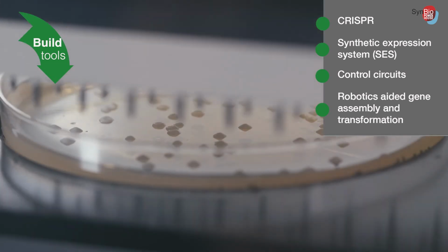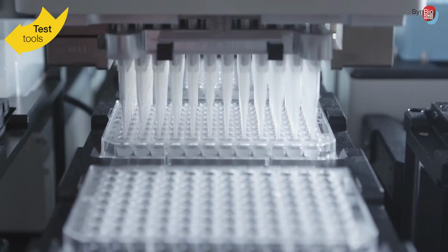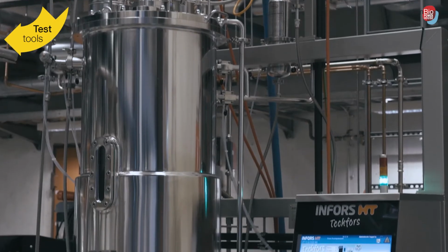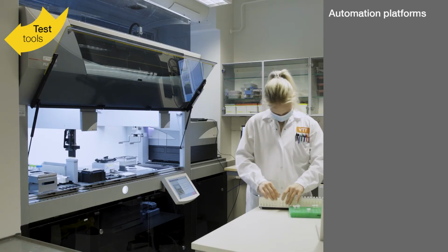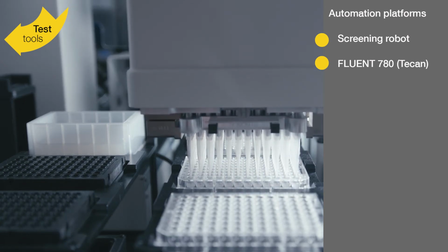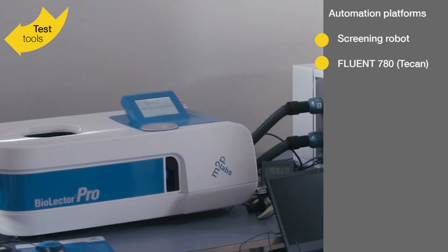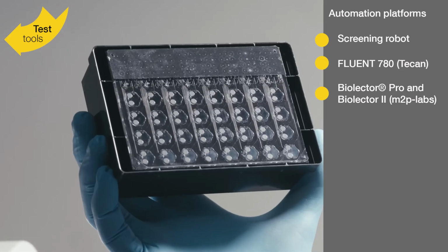Once the desired strains have been constructed, the automated testing facilities at VTT can be used, ranging from microtiter plates to well-controlled bioreactors of different sizes. For the test phase, we have various automation platforms where we can test the strains in various formats. We have the screening robot system where we can test the strains in a microtiter plate format. Then we have a BioLector, which has a bit larger volume, in a slightly larger microtiter plate.